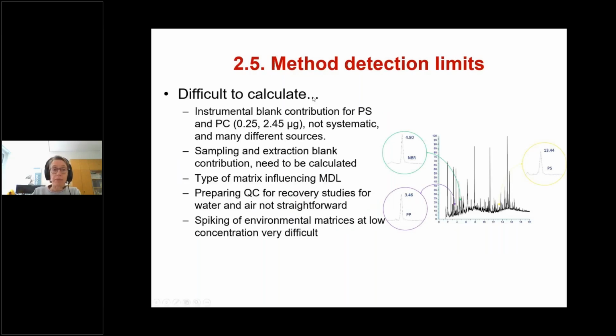When we calculate the method, of course, it depends on the samples that we are extracting. This is an example, a chromatogram of an air sample. We see these two bumps, which is unresolved complex matrices, and the complexity of the chromatogram is very obvious, so it's quite challenging. And in here, it confirms the need to work at accurate mass to determine the different polymers with certainty.